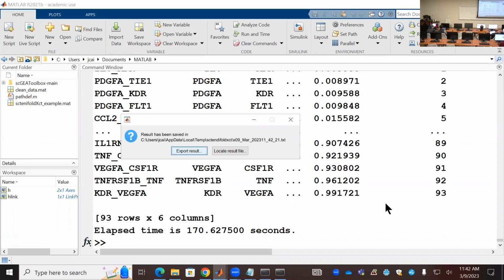You select 2 cell types you want to play with. It doesn't matter which 2. So you can use example data. You select 2 cell types you want to study the interaction between.